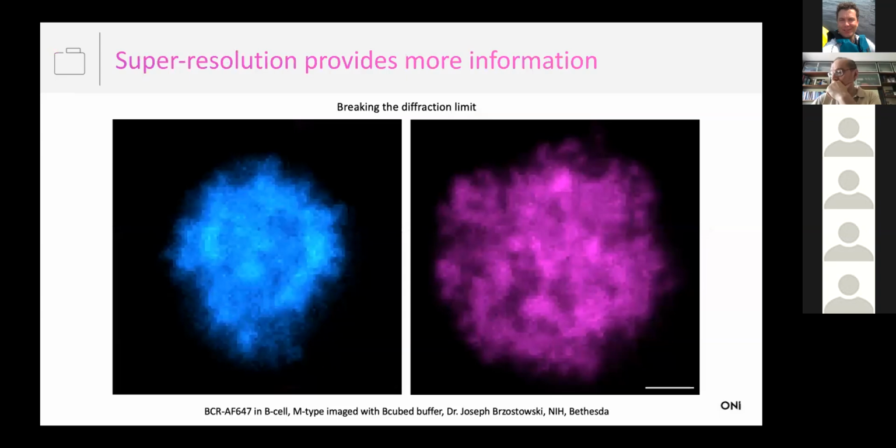The advent of conventional fluorescence microscopy really revolutionized how research was done within the life sciences. It allowed scientists for the first time to tag particular proteins or structures with fluorescent labels to a very high degree of specificity, so it was possible to visualize cellular components unlike previously.